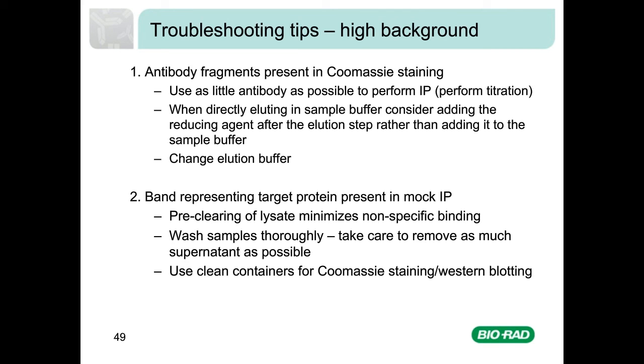If a band representing your target protein is present in the mock IP, pre-clear the lysate prior to the IP to minimize non-specific binding. It is also important to wash your samples thoroughly during each wash step and to remove as much supernatant as possible. You also want to ensure that you are using clean containers to perform your Coomassie staining in. Unclean containers are a common source of gel contaminants.